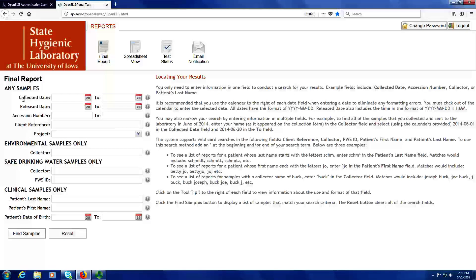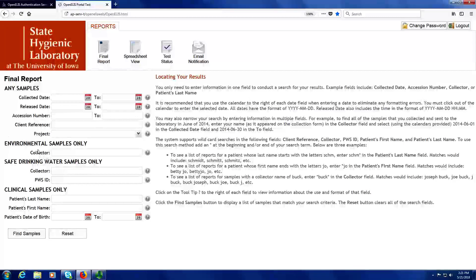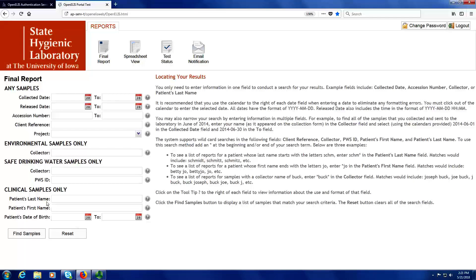These fields apply to any type of sample whether it be a clinical, environmental, or safe drinking water sample. You can also search by the collector name for environmental and safe drinking water samples, or the public water supply ID for safe drinking water samples. For clinical samples only, you can also search by the last name or first name of the patient, or the patient's date of birth including a range of birth dates.